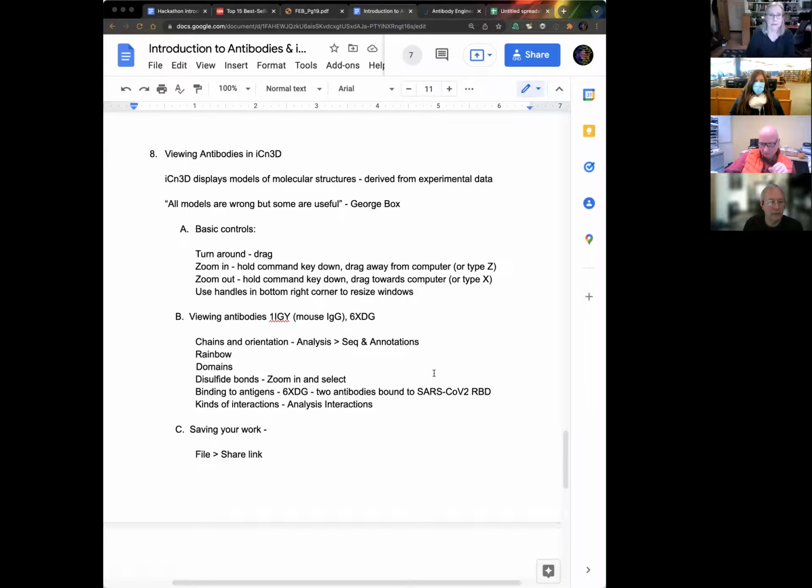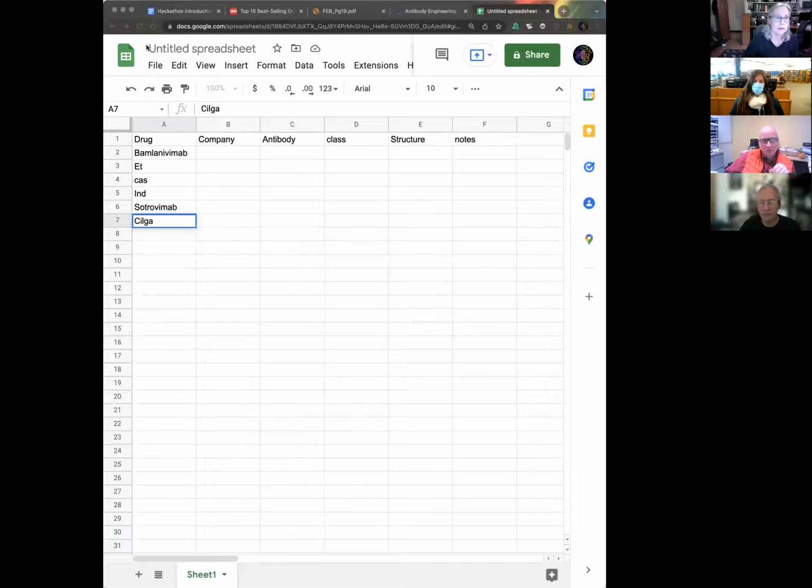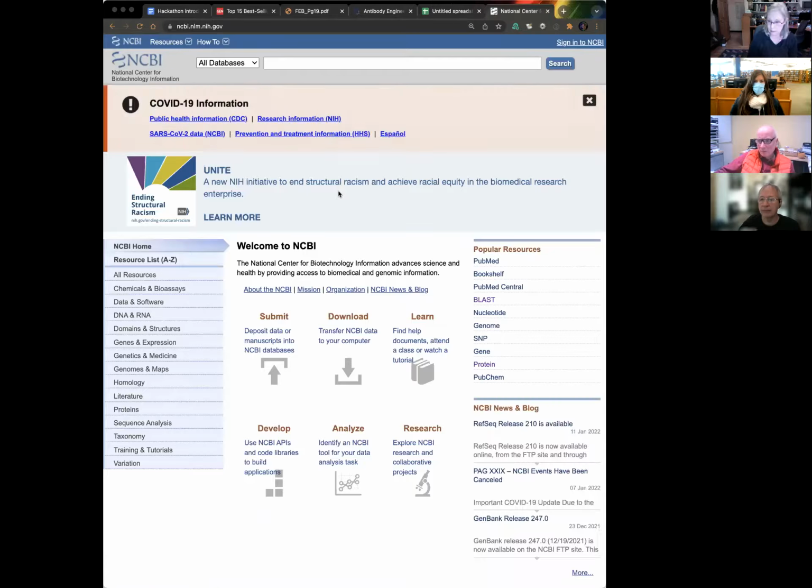Okay, iCn3D. I'm going to take that out of there and go to iCn3D and we're going to take a look at it. And everyone, if you want to take a look at the chat, there's some clarification on this nomenclature and how antibodies go through their process. Okay, so we're going to look at IgG to start.